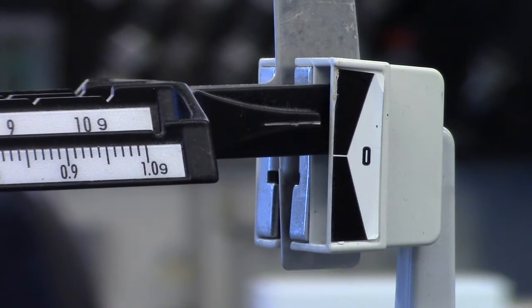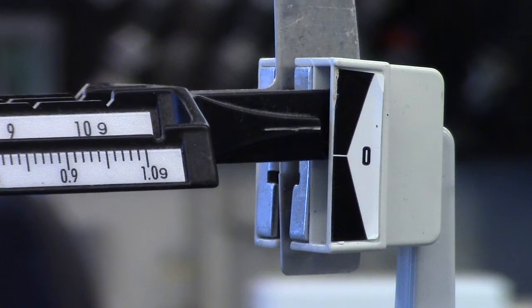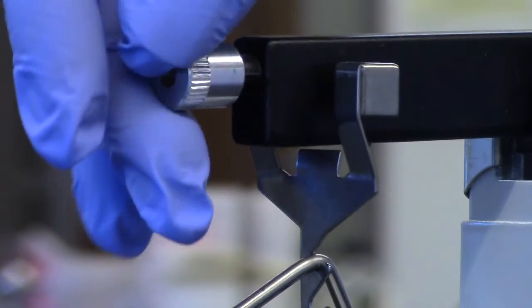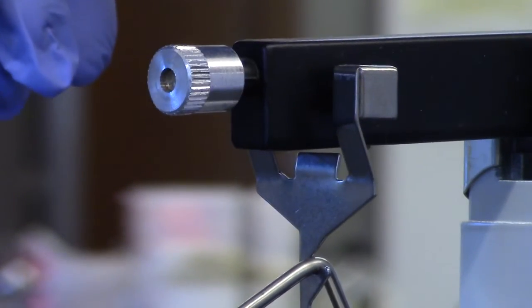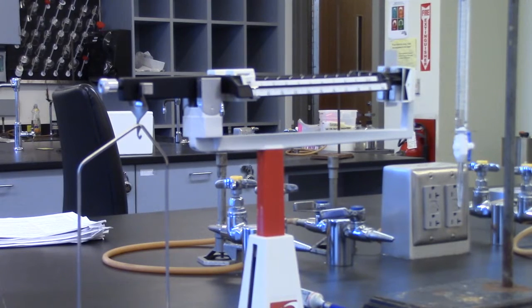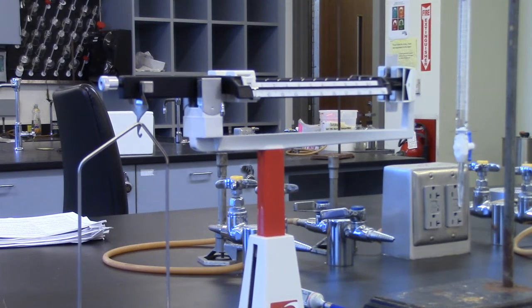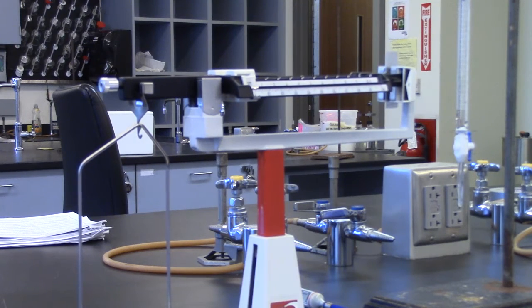If the pointer is above the zero, it means there is not enough mass on the beam, so turn the calibrating screw towards you. Adjust screws so the pointer is pointing to the zero, or swinging equally above and below the zero.